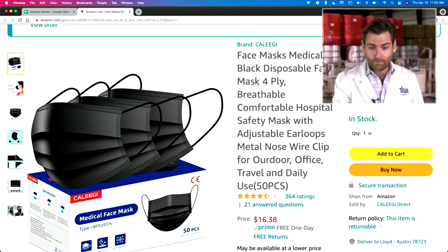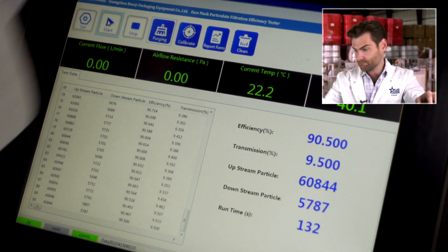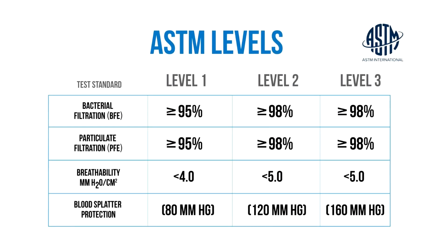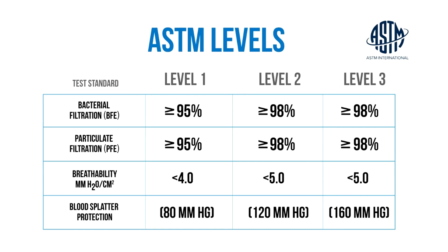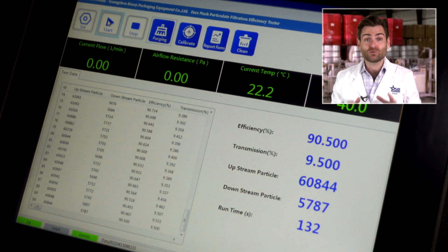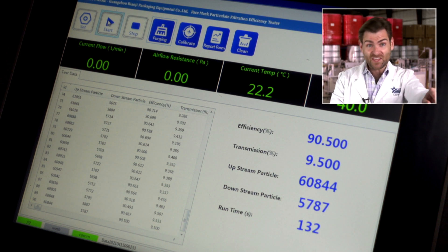This one is the brand Caleegi — same as on the box and on screen. They made the claim it's a Type 1 mask, but does it hold up? 90.5 percent. That is not 95 — 90.5. A Type 1 mask under the EU standard requires 95 percent, very similar to ASTM Level 1, Level 2, or Level 3 — all at 95 percent bacterial and particulate filtration. This entire lab is designed to test to that standard, and they have failed that standard. So I've got to call them out — that's some BS. They are straight-up lying to you. These mouth covers are not Type 1 mouth covers.